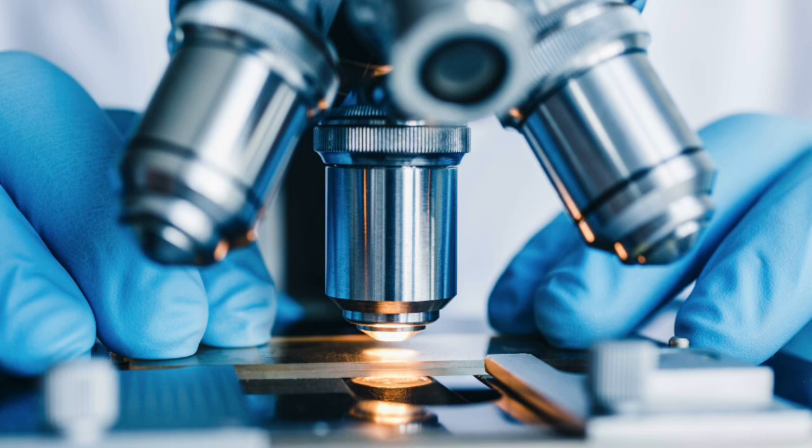Microscopes transform evidence that is invisible into evidence that can speak volumes, allowing forensic scientists to uncover details that otherwise would remain hidden and turn tiny fragments into powerful investigative tools. Without microscopes, much of modern forensic science simply wouldn't exist. From trace evidence to firearm analysis, microscopes remain one of the most essential techniques investigators use in their search for justice and truth.